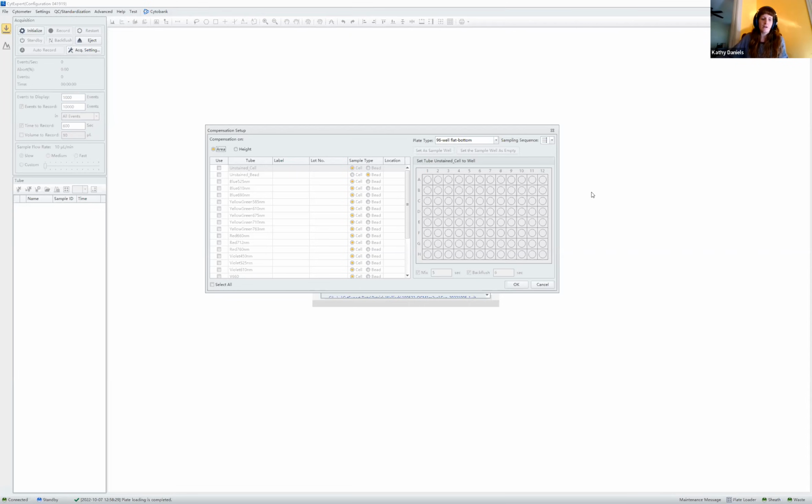I can't tell you how many times people have come to me and the compensation has been off because they've used what I call recycled compensation, and there's no way to recover it. I say, I can likely identify what the issues were here, let's see your single colors. And they say, oh, I don't have those, I ran it back 2 months ago when I first did this experiment. So we definitely want to run them each time.